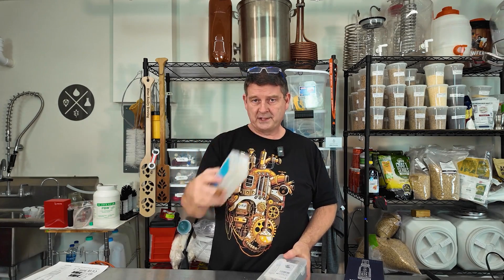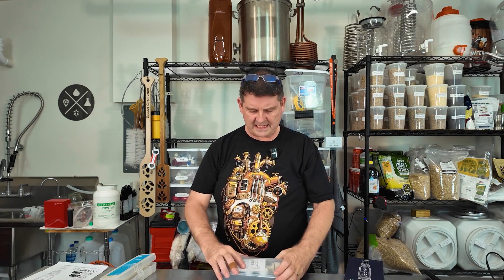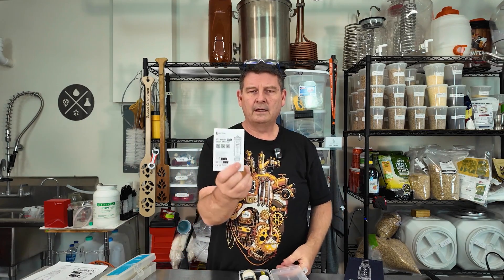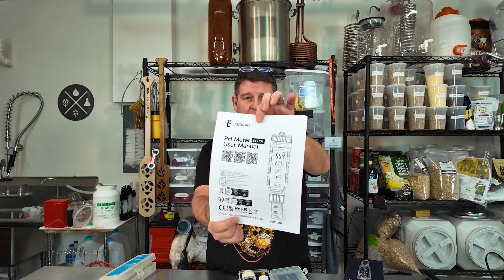This one did come with batteries originally — little watch batteries — so when I had to replace them, you had to run to your drugstore and see if you could find them. I could order them off Amazon but I needed them right away. So we open this up and as we open it you'll see instructions are right on the front — that way you're not going to miss out. And if you have eyesight problems like me, you can take photos and blow it up, or let me know and I'll be glad to email or find a link for the document which you can print out, makes it a lot easier to read.